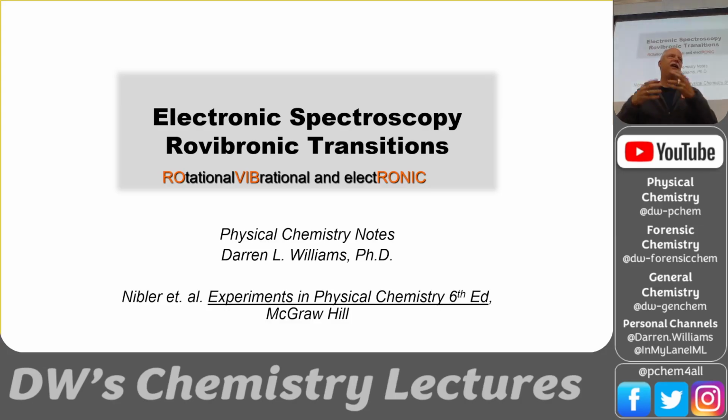You'll just have that week to work on the revisions, and you'll turn everything in to the TA or to the Blackboard. But this week, this is the sort of pinnacle lab that we do: the Ro-Vibr-Onic. So we have rotational, vibrational, and electronic transitions happening at the same time. This is the most complicated spectral transition that we will experience in our lab. So we're going to go through all of the different changes for rotation, vibration, and electronic.